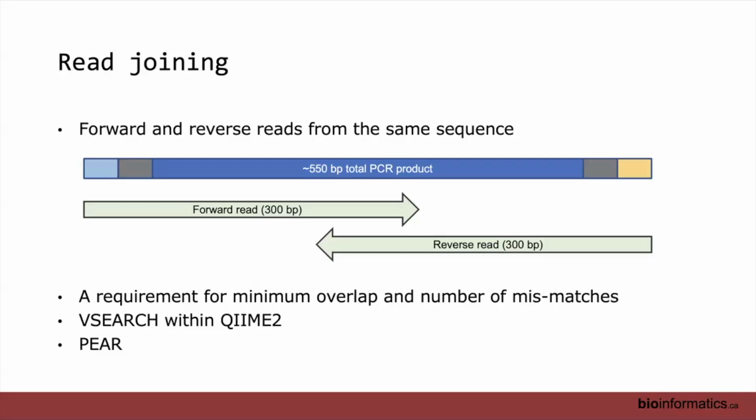Probably more overlap made a lot more sense when sequences were not as accurate, because they've been getting more and more accurate. If you're overlapping, it helps with any errors that you have in the sequencing. If your errors are like 0.01%, that's impacting you a lot less than even 1%.